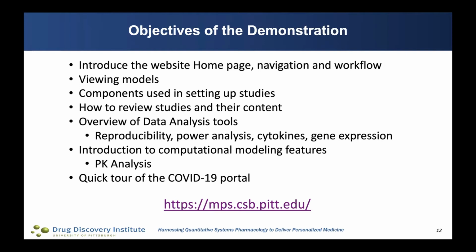We'll look at the components that are used to set up a study, a little bit on how to look at study data and evaluate it, some data analysis, computational modeling, and then a quick tour of a portal, and then we can get on with questions.